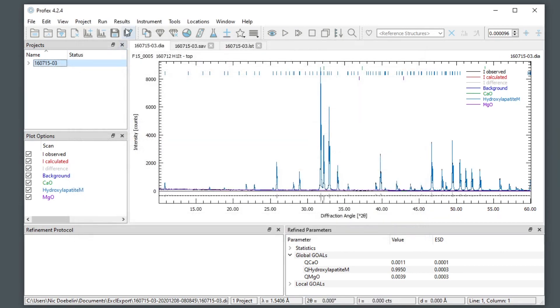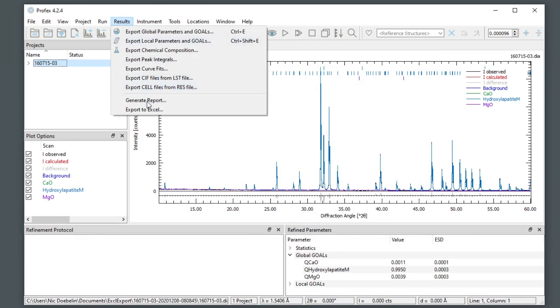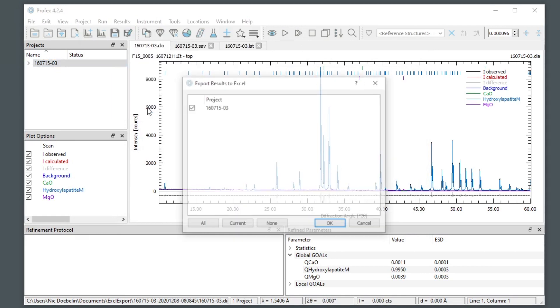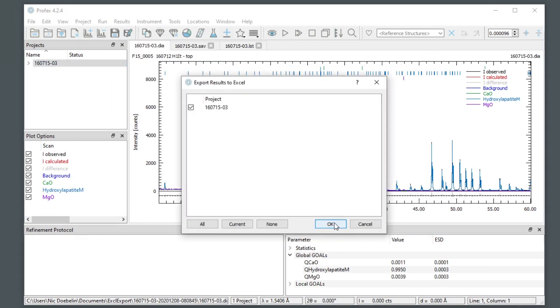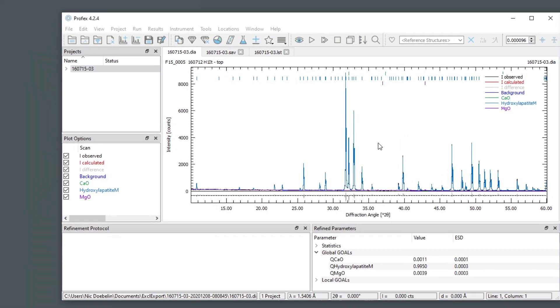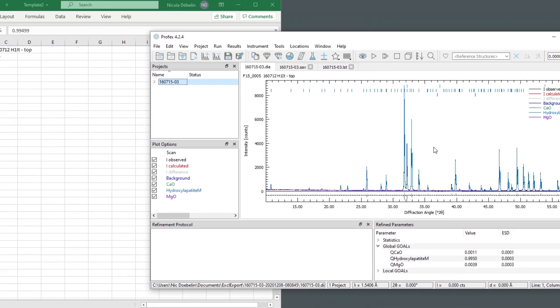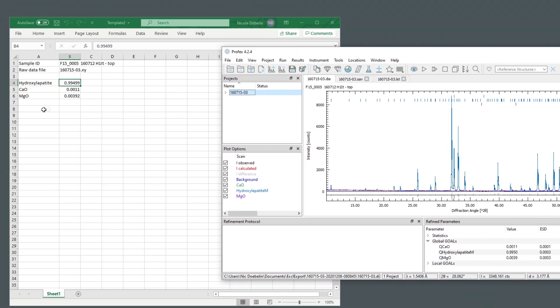And now we can immediately export the results to Excel. And it does the same it did before.